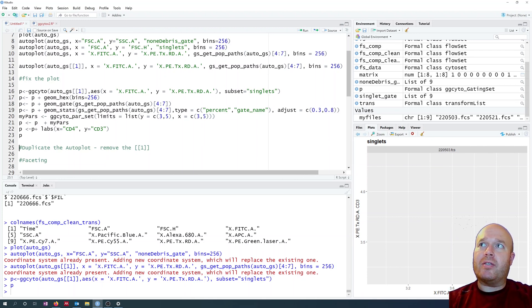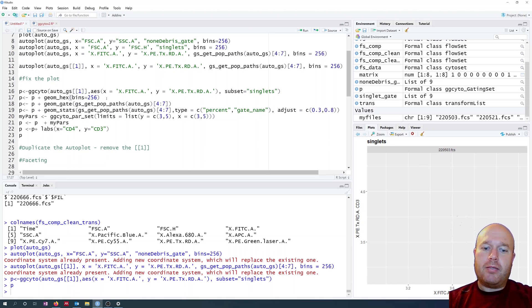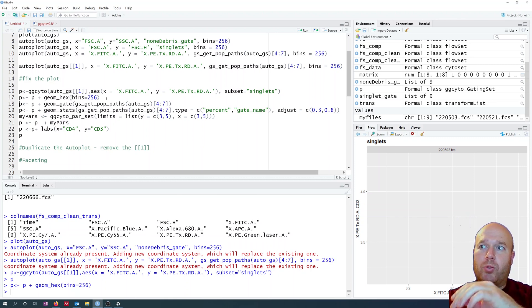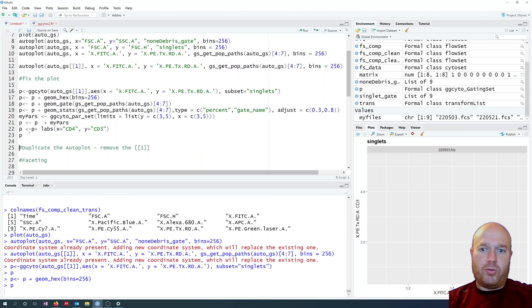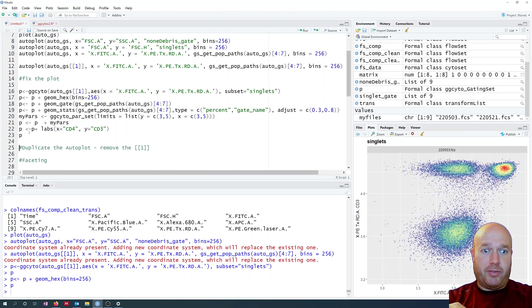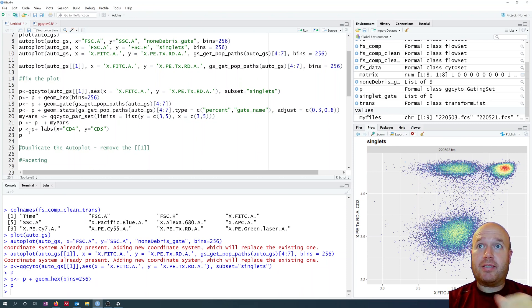Into P I'm adding geom_hex with a bin size of 256, similar to what we did with the older plot. If I go to P now, I'll see I've got some data. Very nice.